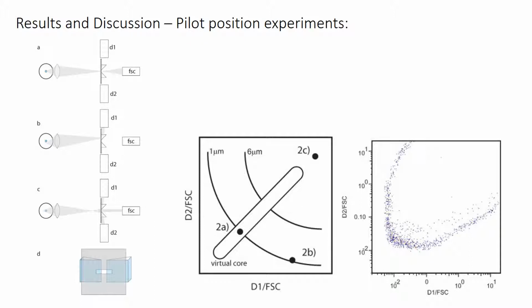On the left-hand side shows the side-to-side motion testing of the 1 micrometer beads. The measurement of 3 PSDs is combined to determine which events come from the center of the stream and are suitable for a cytometric measurement. Scattered light from the center of the stream will pass through the center of the pinhole and is listed as A.